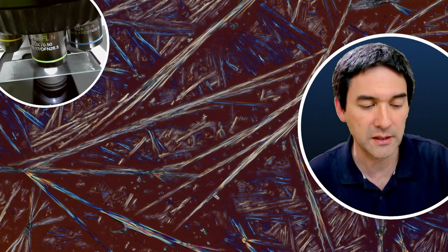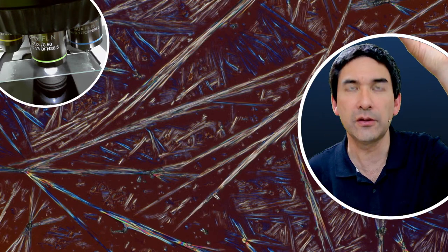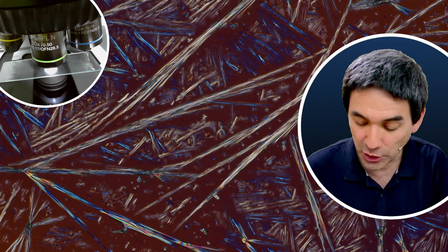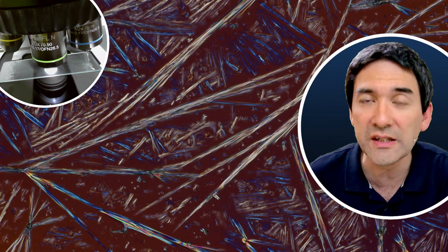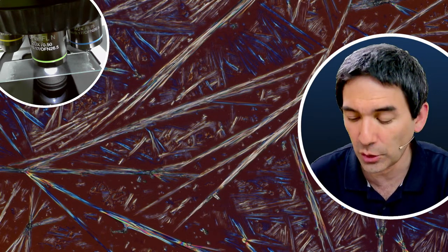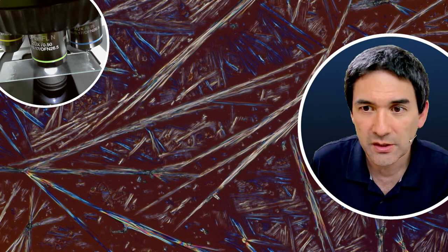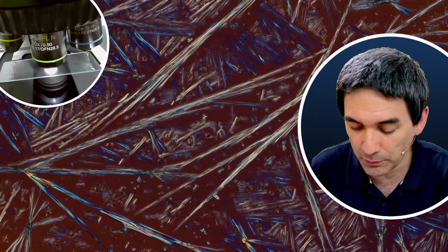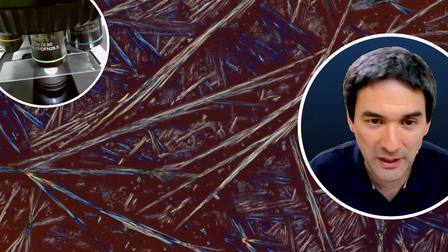Okay, get myself a slide. Sometimes the slides are a little bit dirty, and I think that is okay because a little bit of the dirt can act as a so-called crystallization seed. This is the place where crystals start to form. I'm going to go back again to my stereo microscope, because that's actually what the whole live stream today should be about.